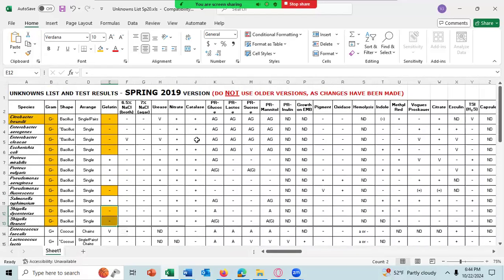All right, so PR lactose AG means it'll narrow it down to these four species. So we narrowed it down to 11 or 12, then I don't know, 7 to 8, and then narrowed it down to four with these three tests. I will be giving you the first three tests. After that point, you guys will be deciding which test to run. And since you've narrowed it down to these four species, in this case, you would then want to find a test to narrow it down further.